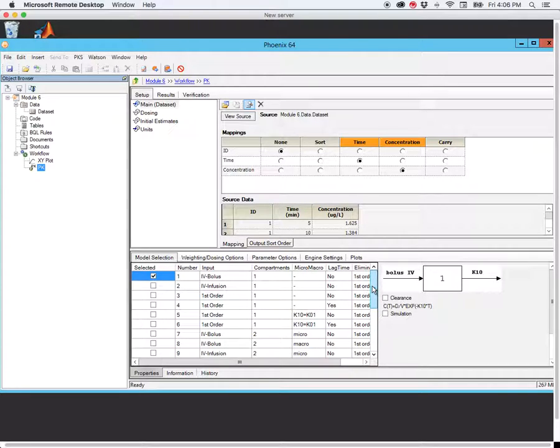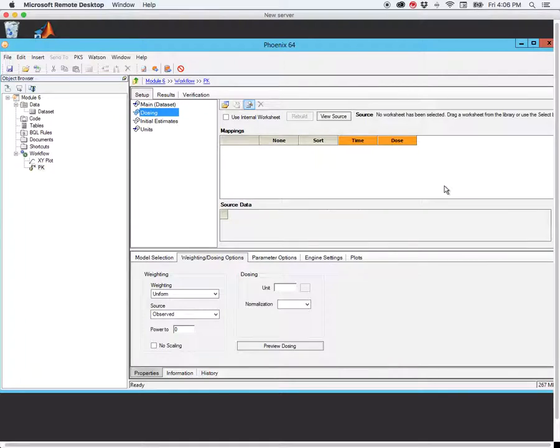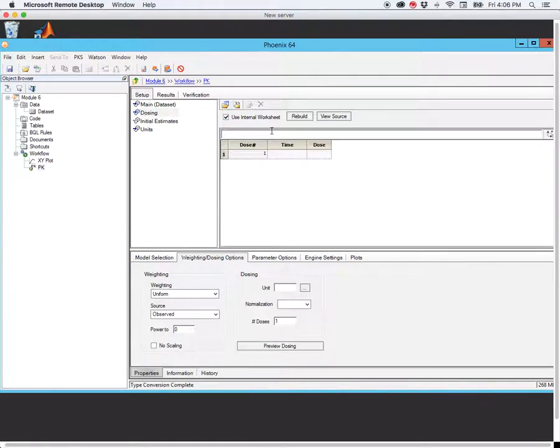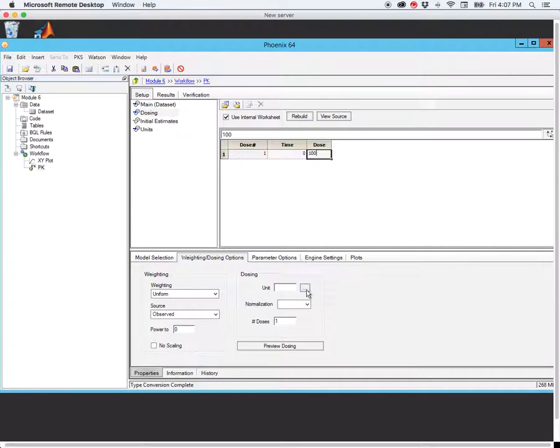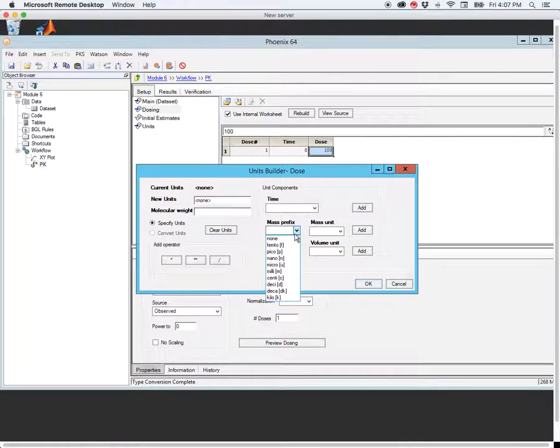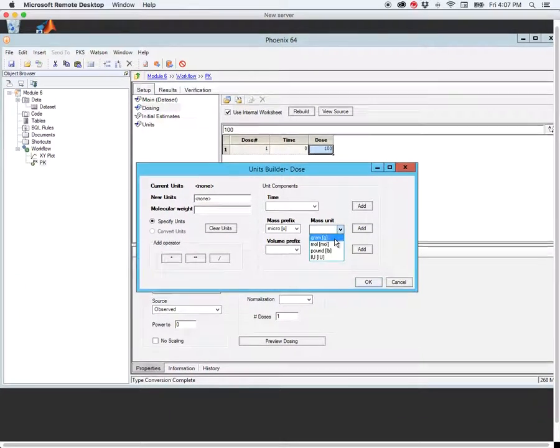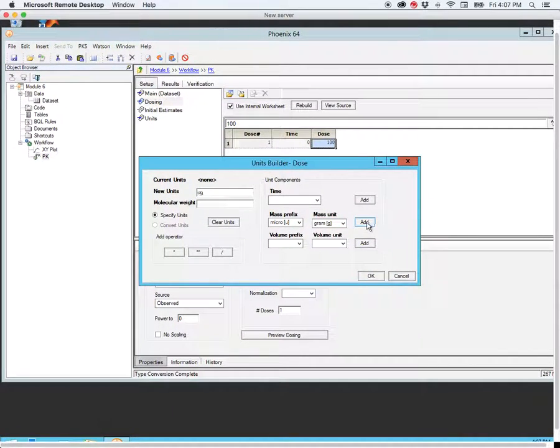So, choosing the one-compartment model first. We start off with the one-compartment model and choose that. We move down to dosing, and we will check internal worksheet because we want to enter our dose by hand. Our dose was given at time zero, and we know for this data set that it was a total dose of 100 micrograms. It wasn't given on a milligram per kilogram basis, so we enter a total dose of 100 micrograms.